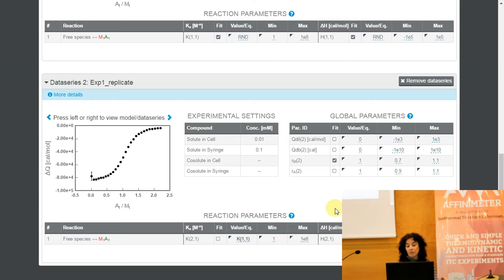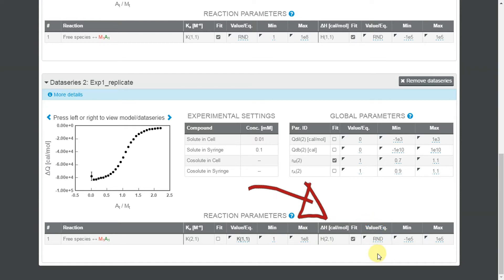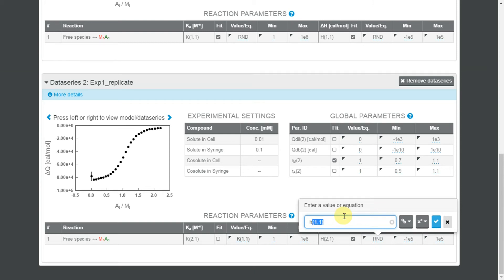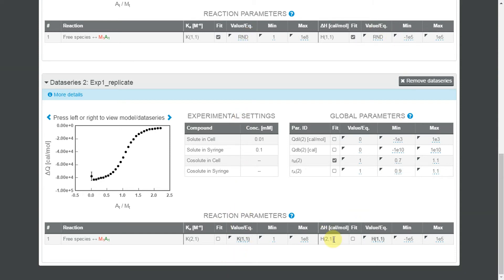I am going to do the same for the enthalpy. Clicking on the Value Eq box of h2-1, I will type h1-1, to impose the restriction that h2-1 of the second isotherm has to be the same as h1-1 of the first isotherm. If you pay attention to the Fit box, you will see that since I am linking the two constants and the two enthalpies, the Fit box remains unchecked for the second isotherm, because k and h of the second isotherm are now linked to the parameters of the first isotherm.